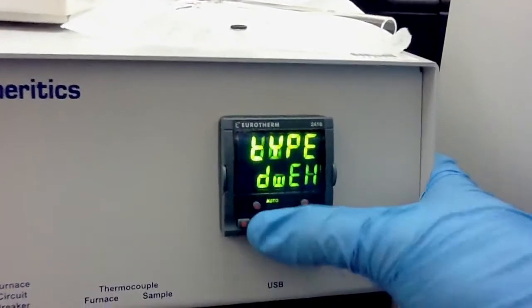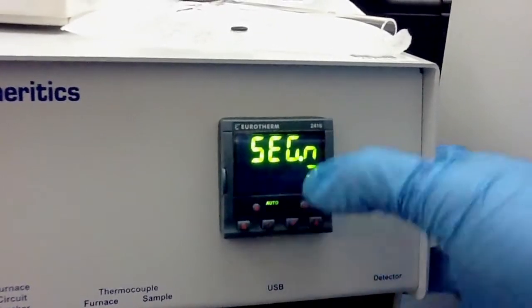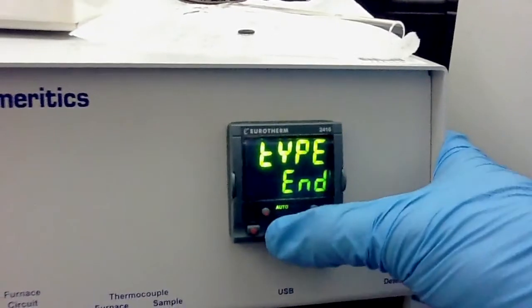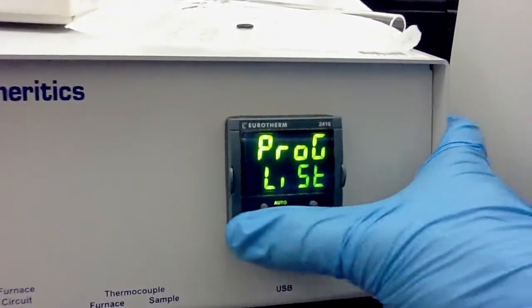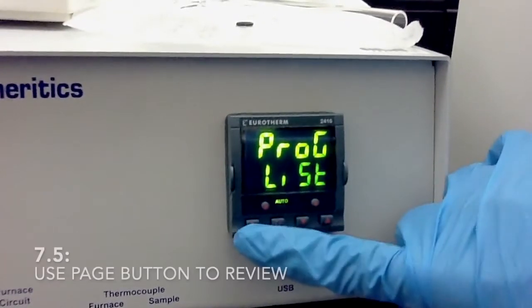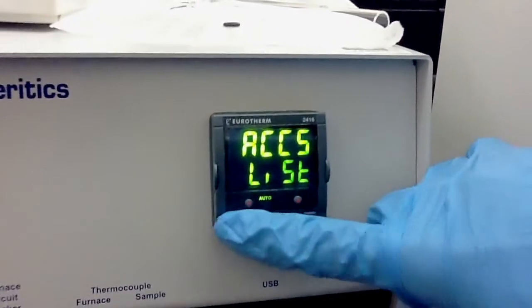How long? It will stay on the temperature 60 minutes. And after that, in segment 3, it will stop this setting heating up and it will go back to stop. So once we set this up, it will go back to the program list. Now we have it. Press this space to read it out. So we set everything here.